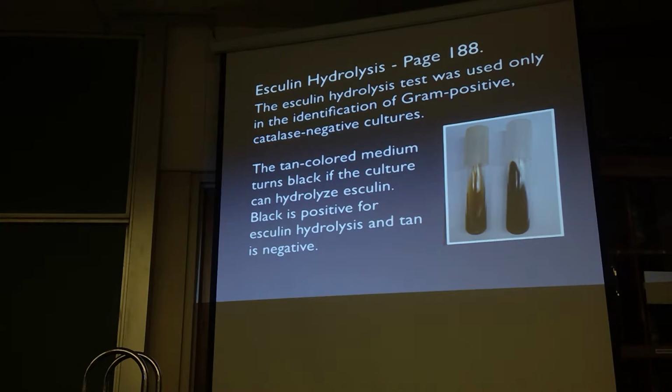Oh, here's one. Okay, so this is our esculin medium that has a positive reaction. These organisms can hydrolyze esculin. We know this because the medium is now black. The esculin medium starts out a kind of gray tan.